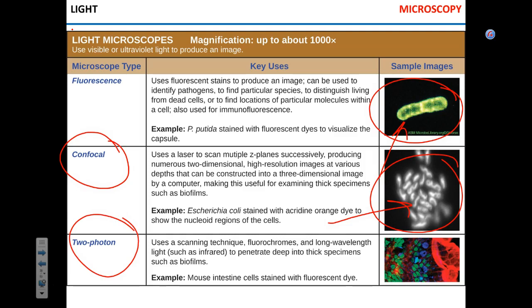This is called 2-photon microscopy. Now this is magic at its best. I have no idea how this works. I will never be able to understand the physics of this. I can tell you what it does though. You can take a live specimen, any live specimen, from a bacterial biofilm to a thin slice of animal muscle. If you can, anesthetize a mouse and slide the muscle under the objective.